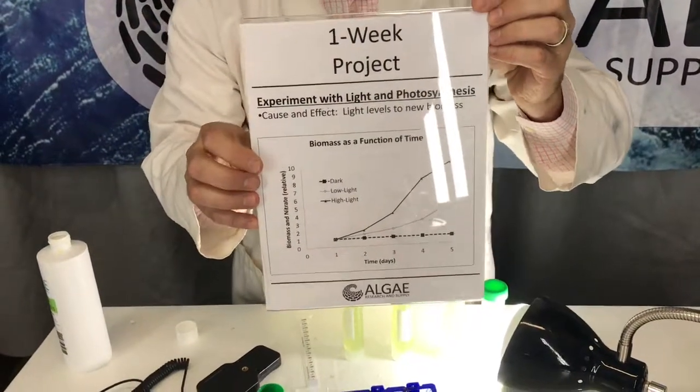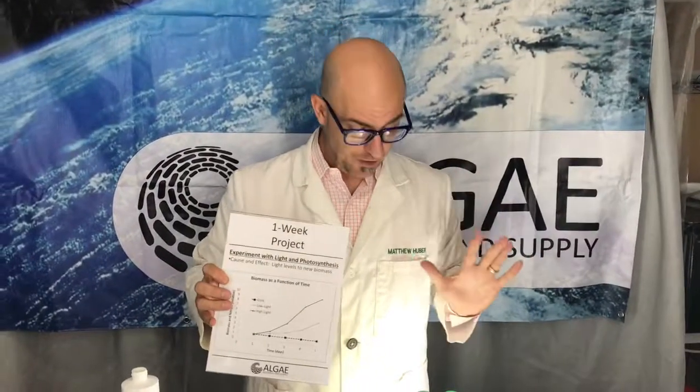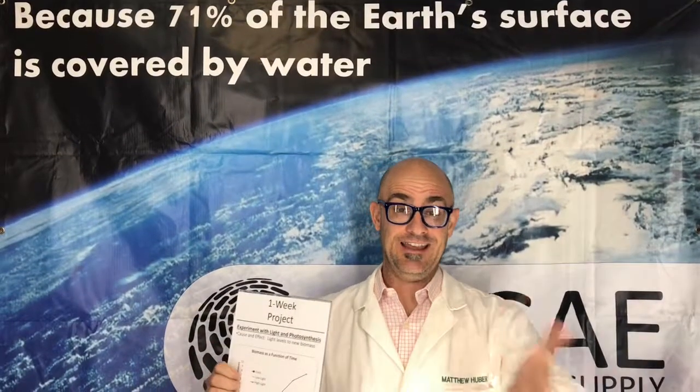You'll actually be able to watch the biomass grow. This is so slick, clean, and absolutely repeatable that I hope you have a lot of fun with it and, more importantly, learn about photosynthesis and microalgae — because this is a water planet and we have to get people to understand this stuff. That's it!